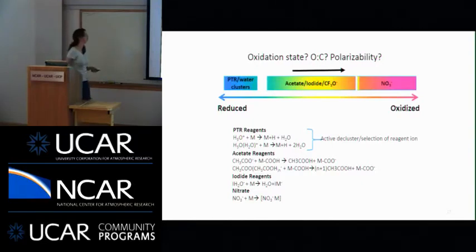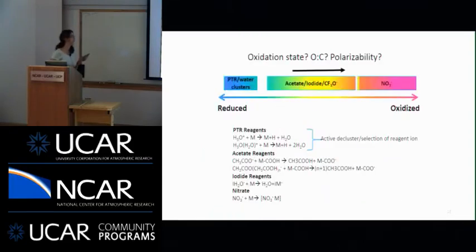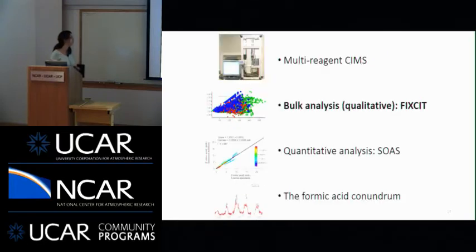And what I'm going to do in the next few moments is use a bulk analysis approach from various chamber experiments where we took a whole pile of mass spectrometers and put them all in one room, one very hot and stuffy room, attached them to a chamber and looked at the data. And what I'm going to do is use this data to see if we can refine this picture of chemical ionization mass spectrometry a little bit.